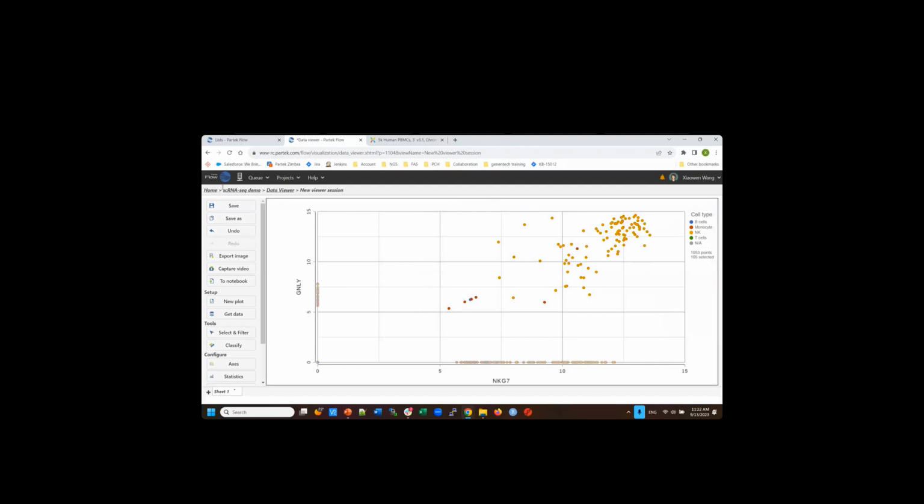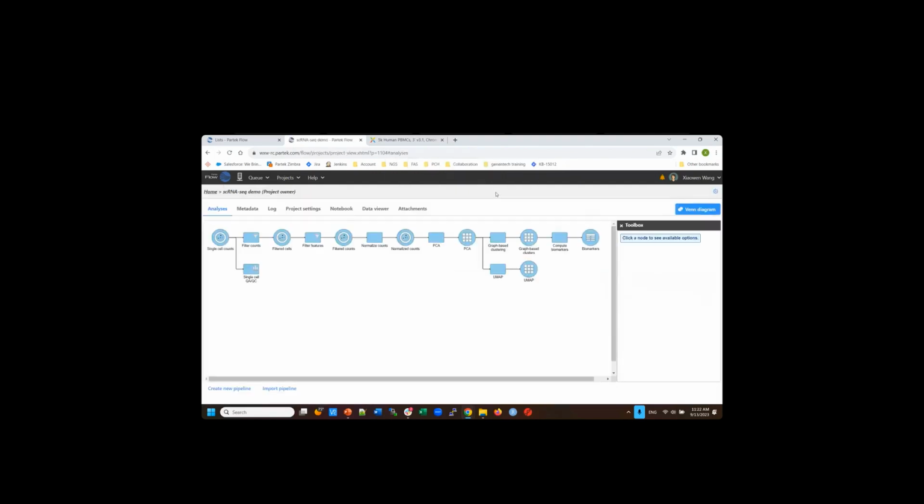All right, so once we have a cell type classified, all the downstream analysis should be very easy. But the important thing, the next thing, is that I want to perform a differential analysis. Since I only have one sample, I want to compare which genes are showing differences between the T cell versus B cell, for example. Okay, you can only answer this question this way.